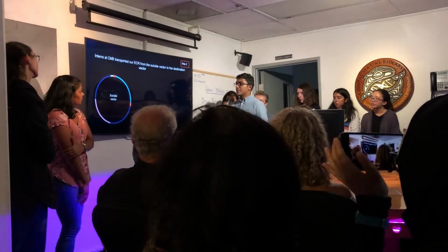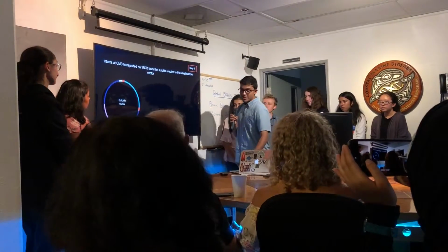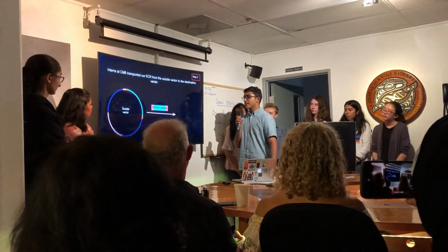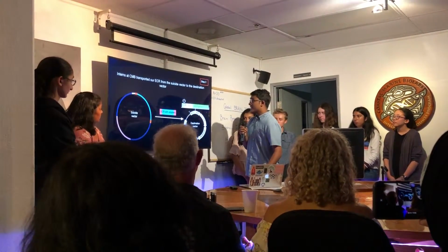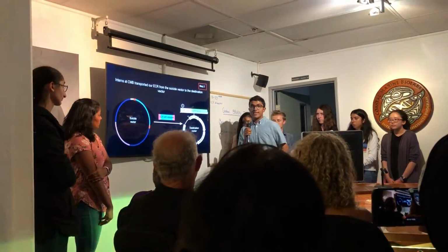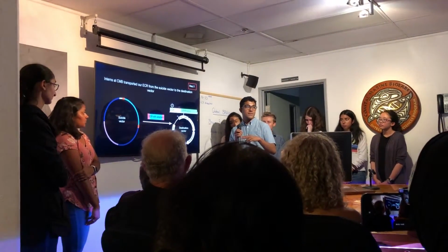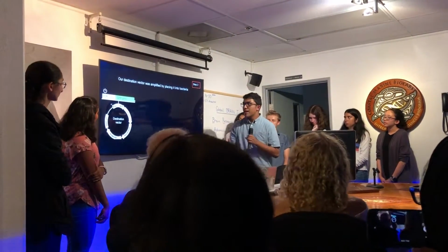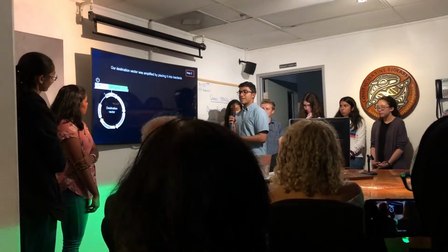So the interns at CMB started off with our suicide vector. They used restriction enzymes to cut it out of the suicide vector, leaving us with just the ECR with the adapters on the ends. Because the ECR has the adapters on the ends, it easily attaches to our destination vector, which has spaces for the adapters. So now we have our destination vector with ECR, our minimal promoter, and the GFP gene.